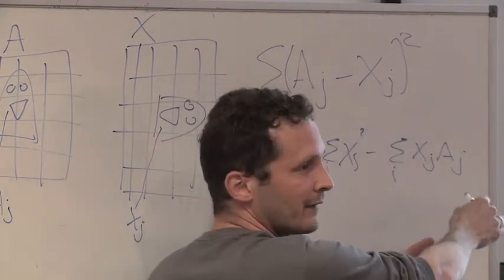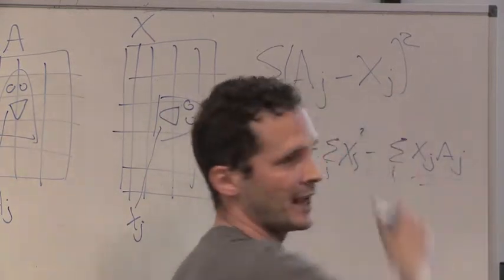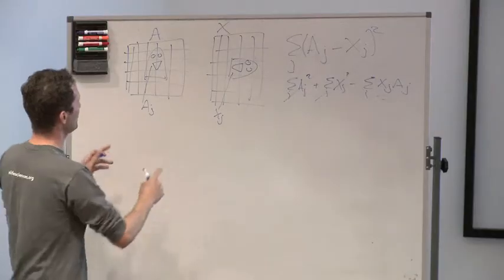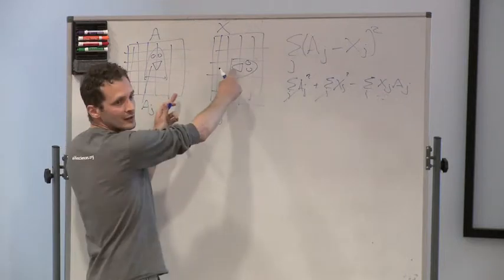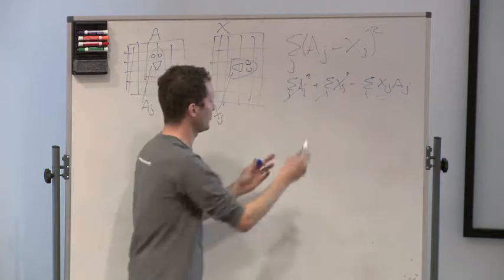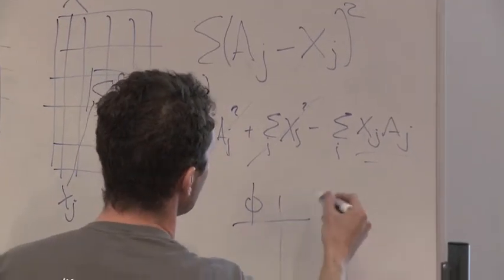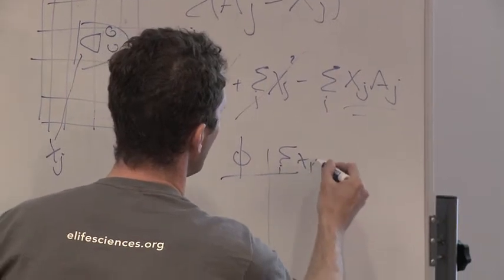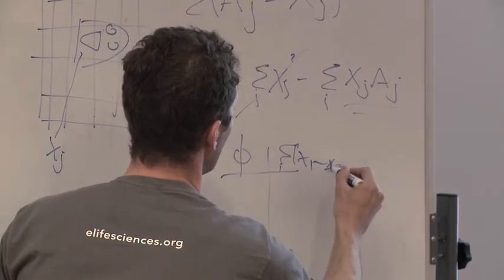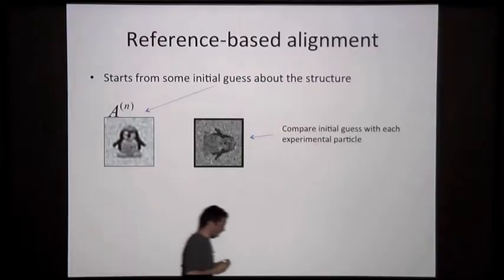And here we go back again to the similarity between cross-correlation or scalar product and square difference, okay? So what we're going to do is calculate this for this orientation, rotate the image, calculate the value again, and then in the computer we can just take a table where this is the rotation and this is the value of that one, and we're going to pick the minimum, okay? So let's have a look.